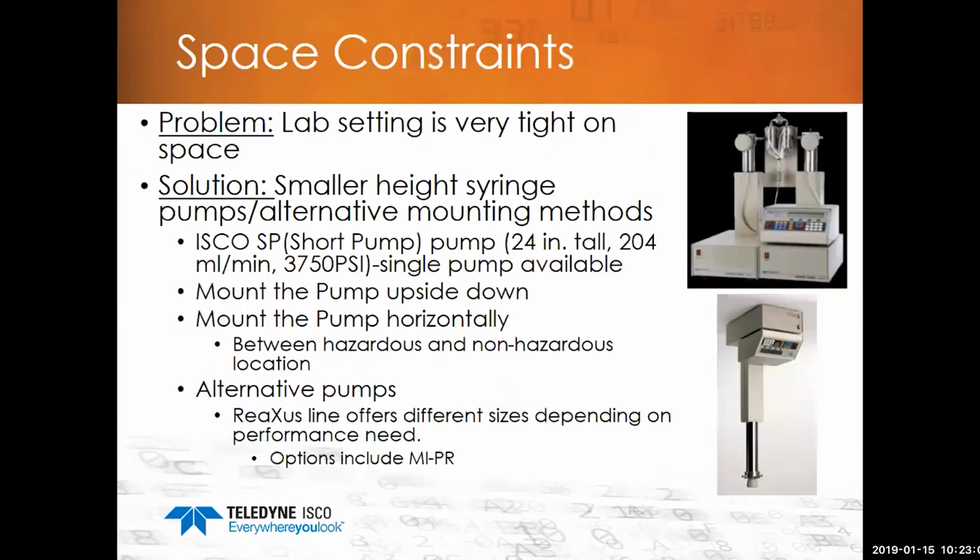That's one thing that you need to look at. Another one we just talked about is space constraints. Is your lab, where you're going to be, tight on space? That tells you the different types of pumps you can use or sizes you can use. That's something you have to consider.